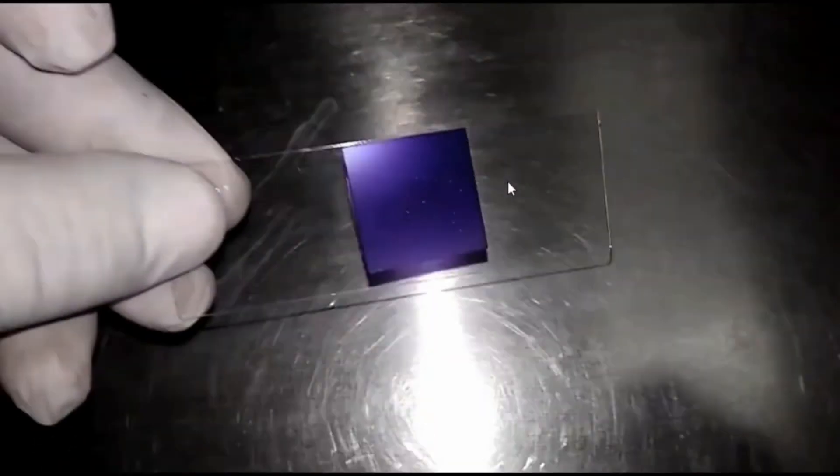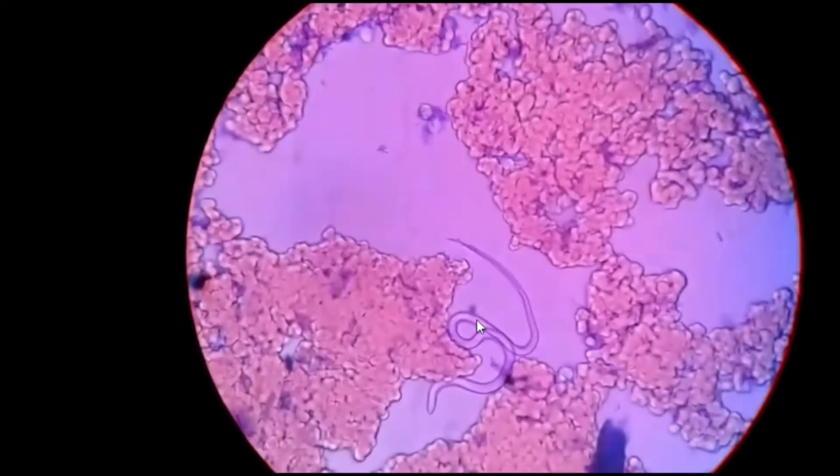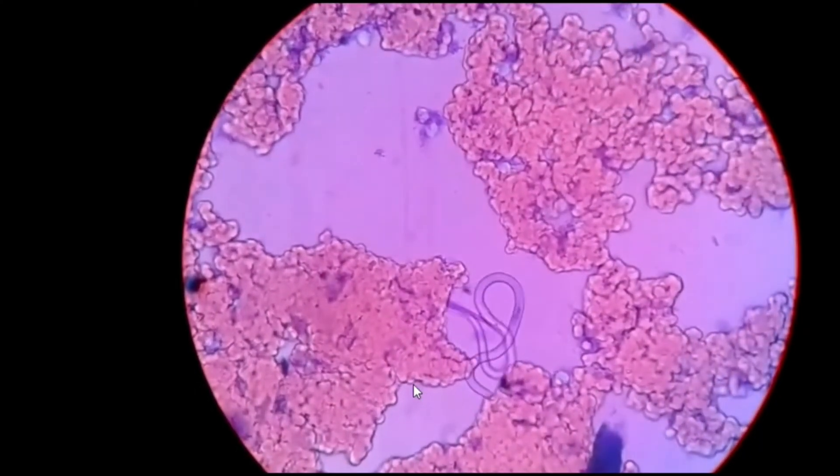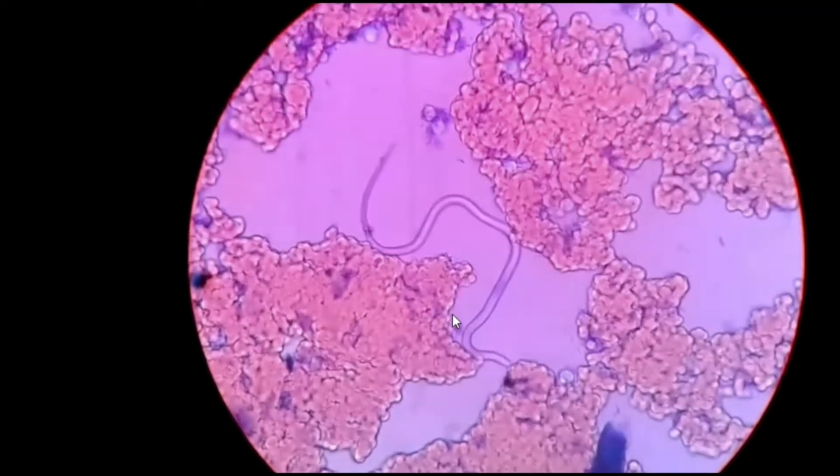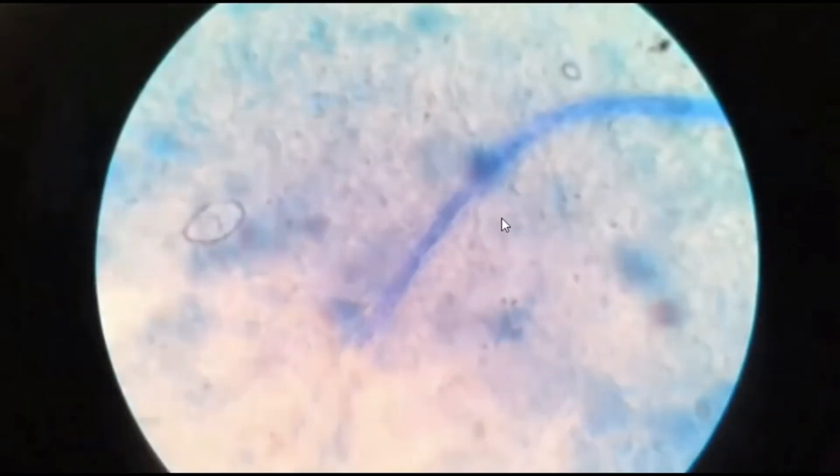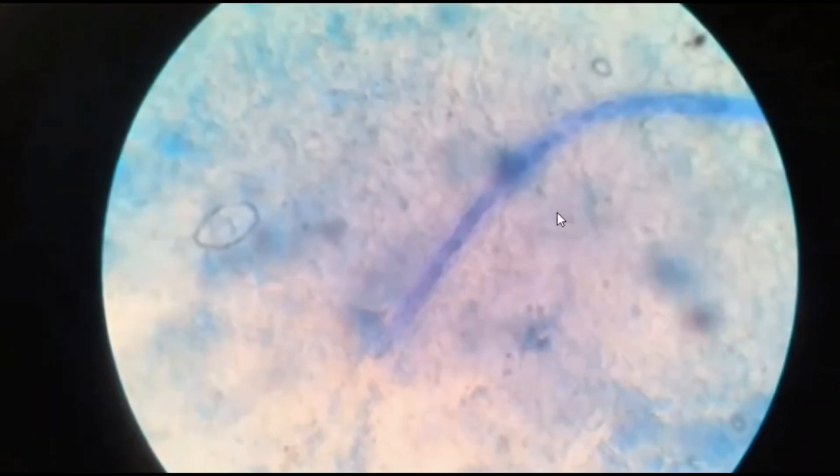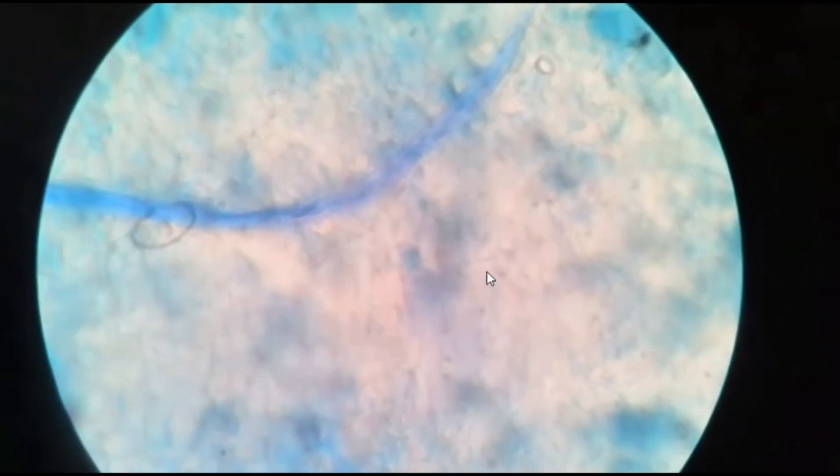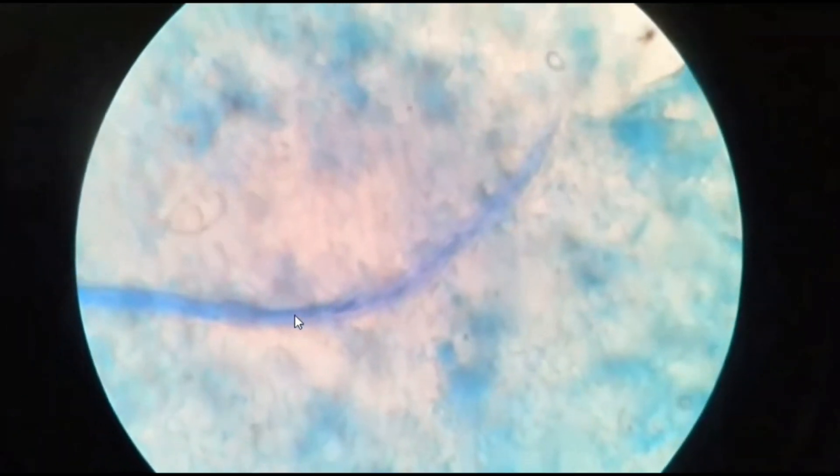So let's go with this slide. Oh my god, here you can see this one is the live microfilaria, isn't it? Here you can see movement, isn't it? And this one, dead microfilaria. We are observing at 100x objective, that is oil immersion field.